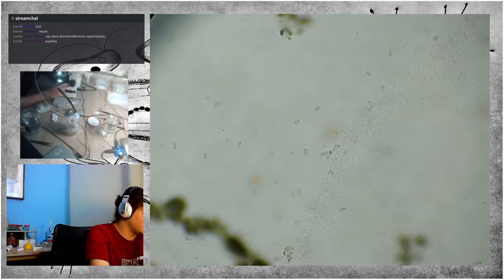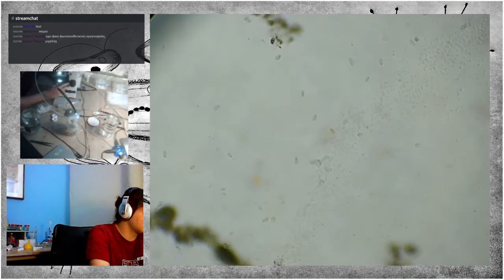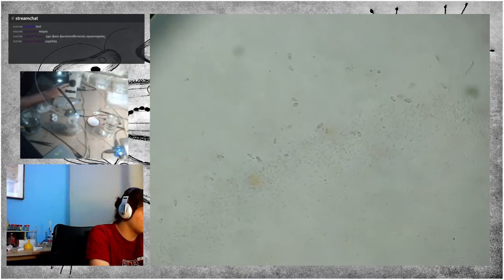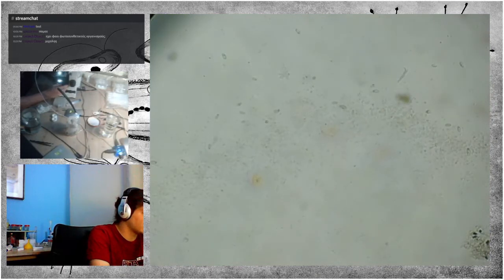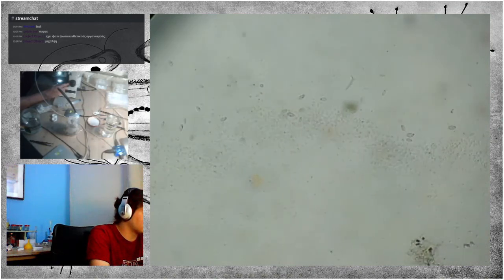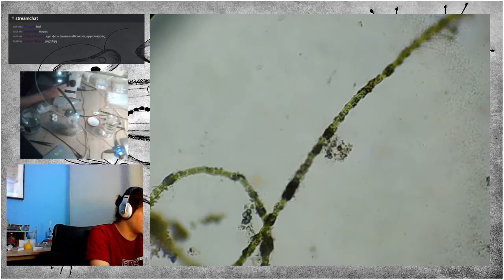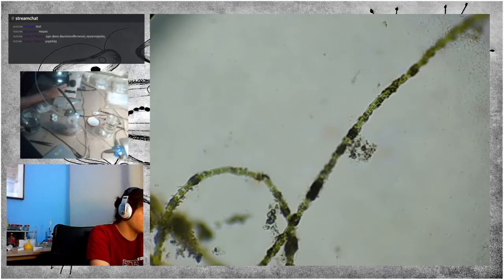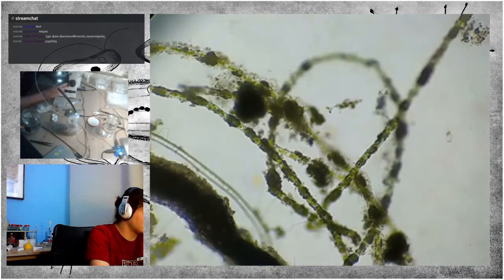Either they are microorganisms, like, for example, ciliates or amoeba, or larger organisms that could be plant-eating mammals or insects or whatever, or even small animals, microanimals, like rotifers or copepods and small crustaceans.